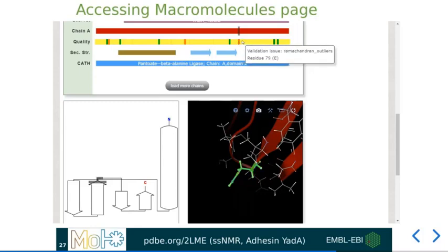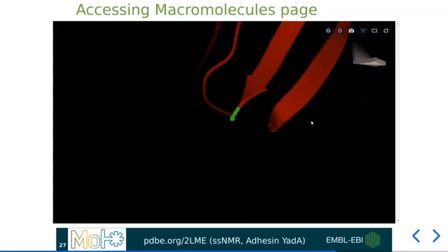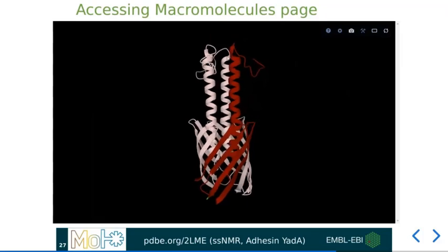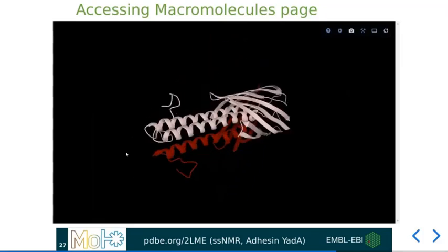Now, this instance of MolStar is very similar to the previous ligand-specific version. Now again, if I click on the toggle full screen icon, I can get a full, that's why I reset the view here, there we go. I can get a full maximized window.